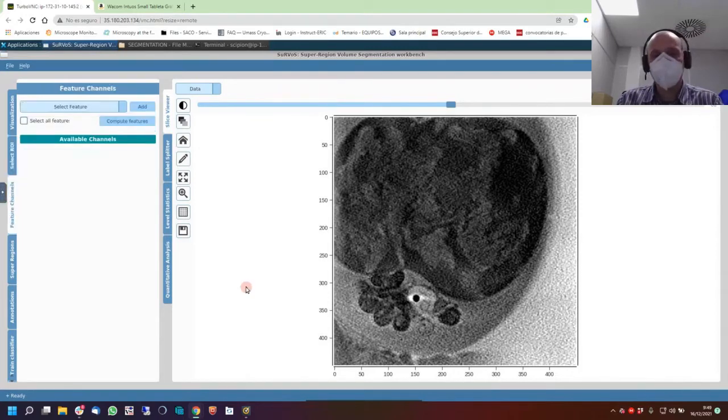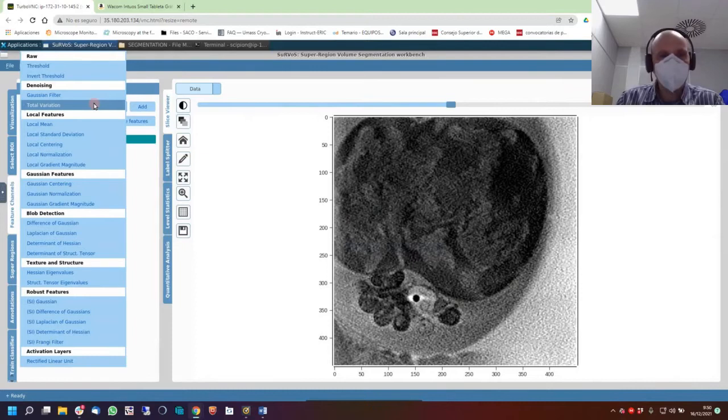Let's go to feature channel. What is feature channel? You have it all in the documentation, and in the course there are a lot of filters and tricks that you can use in this software.